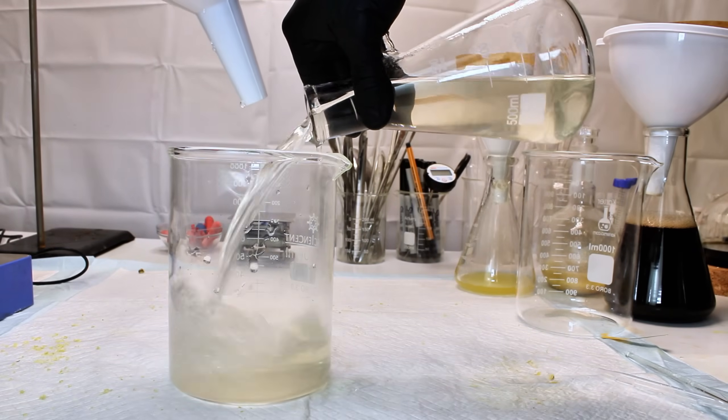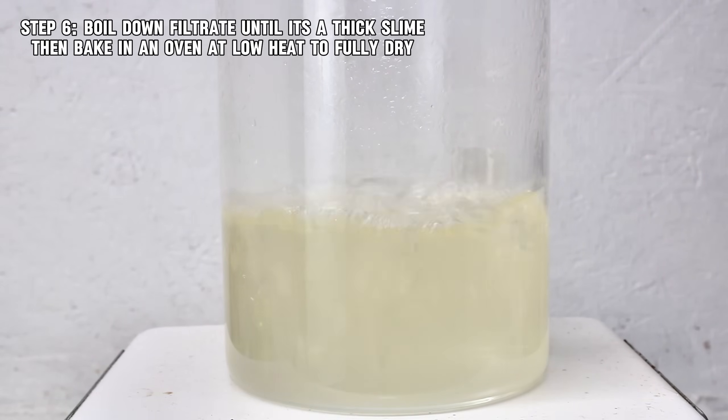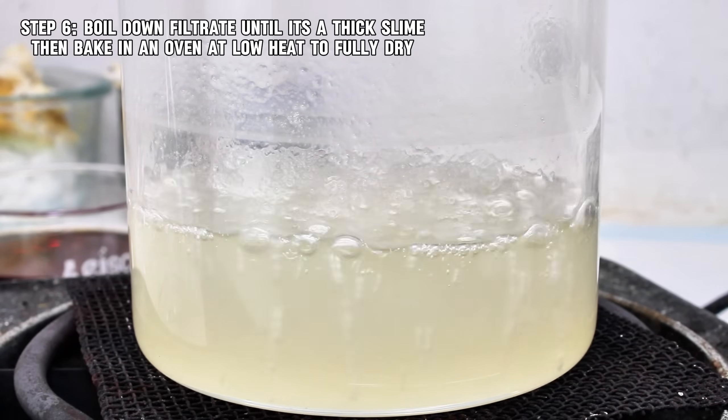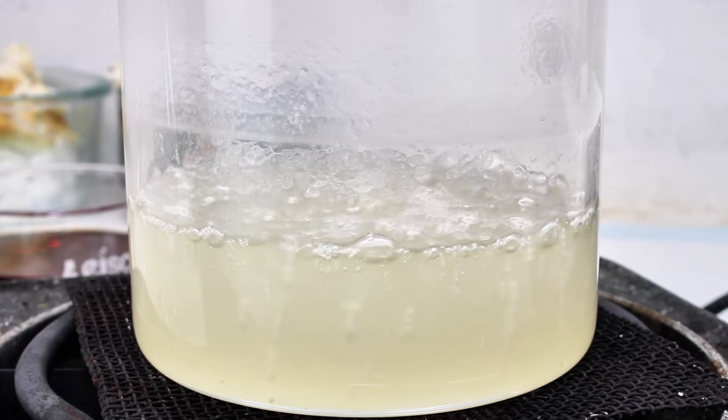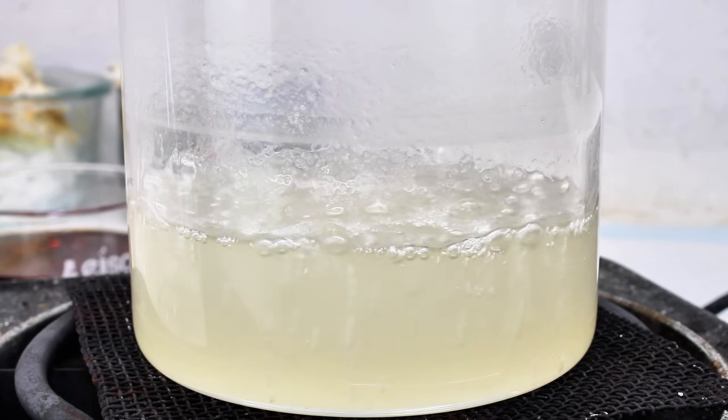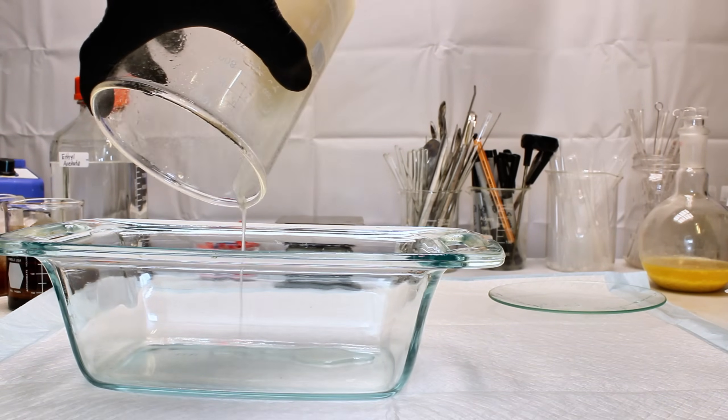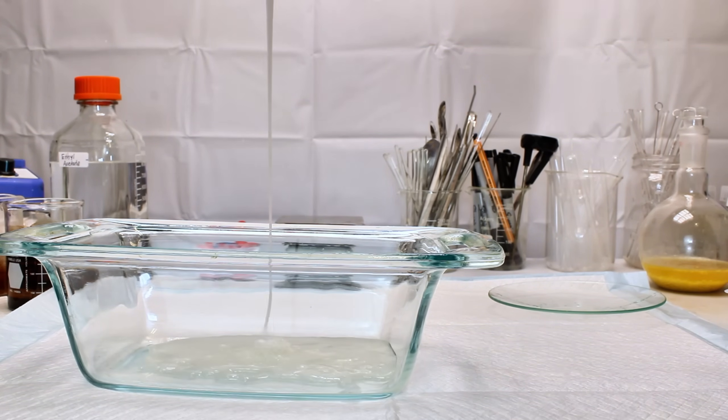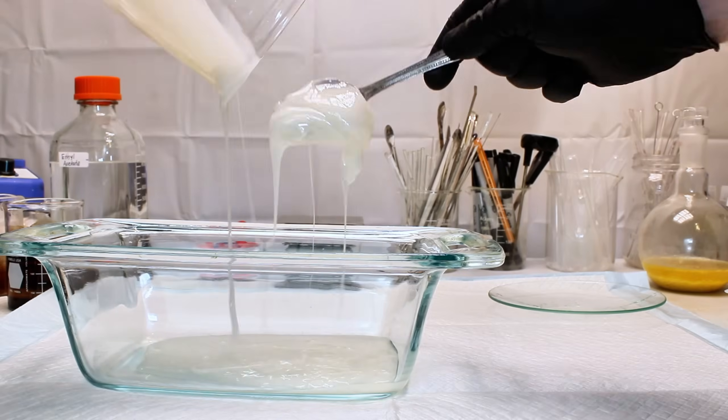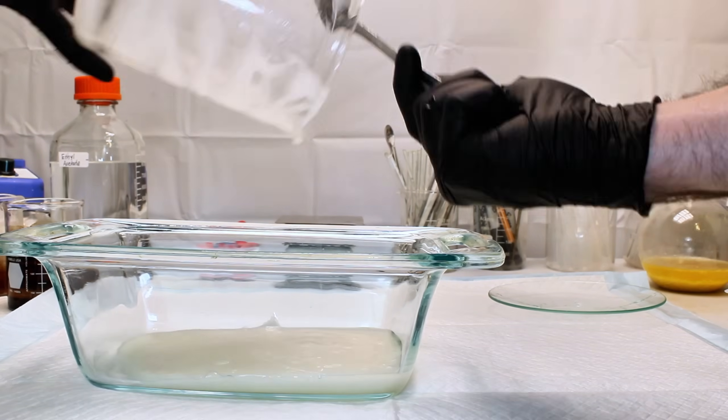The filtrate was then returned to the beaker and boiled down until a gooey slime remained. Calcium nitrate is extremely hygroscopic, as I mentioned earlier, and virtually impossible to crystallize. To that end, the slime was transferred to another dish and baked in an oven at 100 degrees Celsius until it had dried completely.